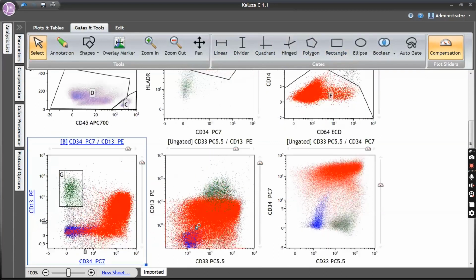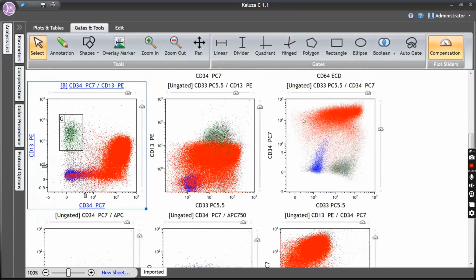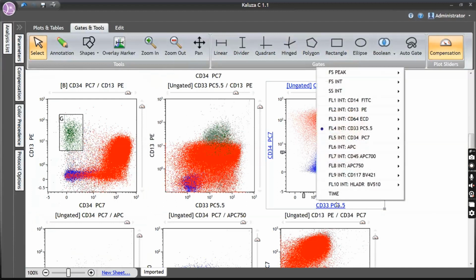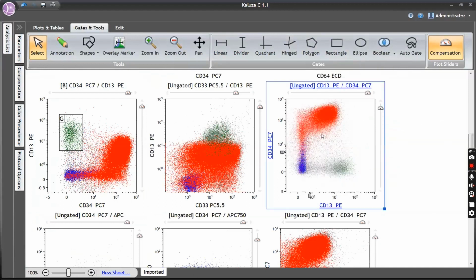Okay. So you have CD33 positive. What is the expression? CD33, lymphocytes are the internal control. Heterogeneous. Okay, now CD13, positive in a dim fashion. Okay, so this is the normal internal control. It is dim to moderate. There is a population which is falling in between the negative control and the positive.